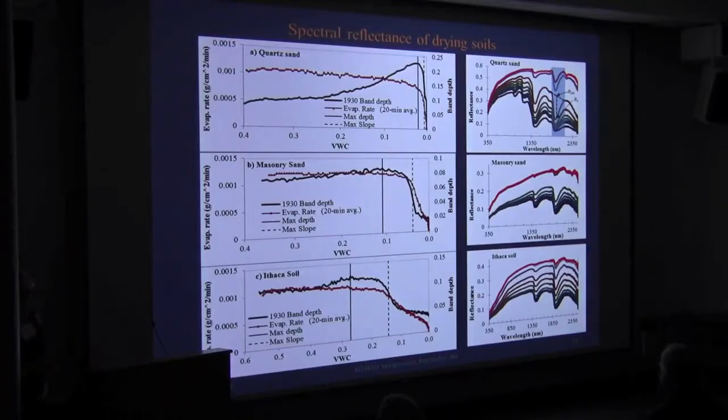Entirely fortuitously, this drop-off occurs at the same time as that. We're looking at different things: reflectance and evaporation rate, and they happen to coincide when the water adsorbed to the particles is disappearing and you're starting to see some particle left over. It happens with all of the soils, no matter what, even though the timing is very different with the volume water content or with the actual time. We're seeing the same sort of thing going on.